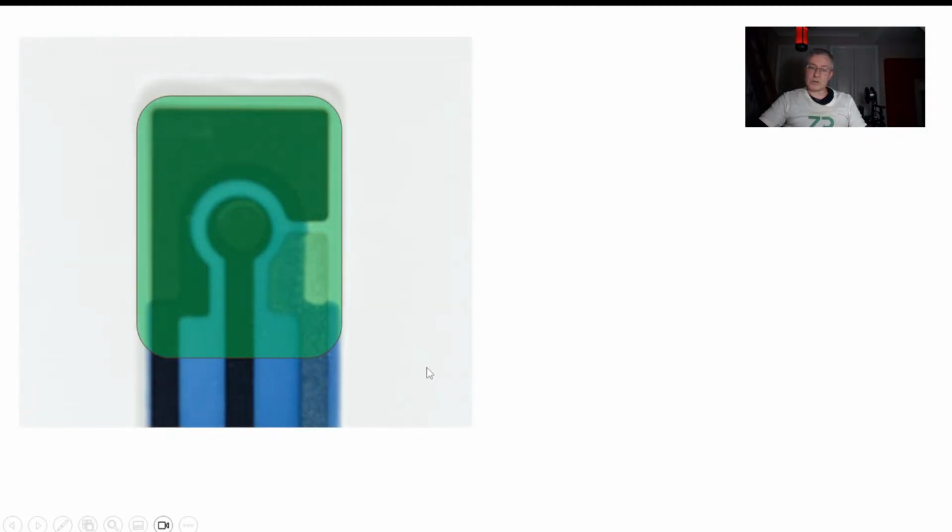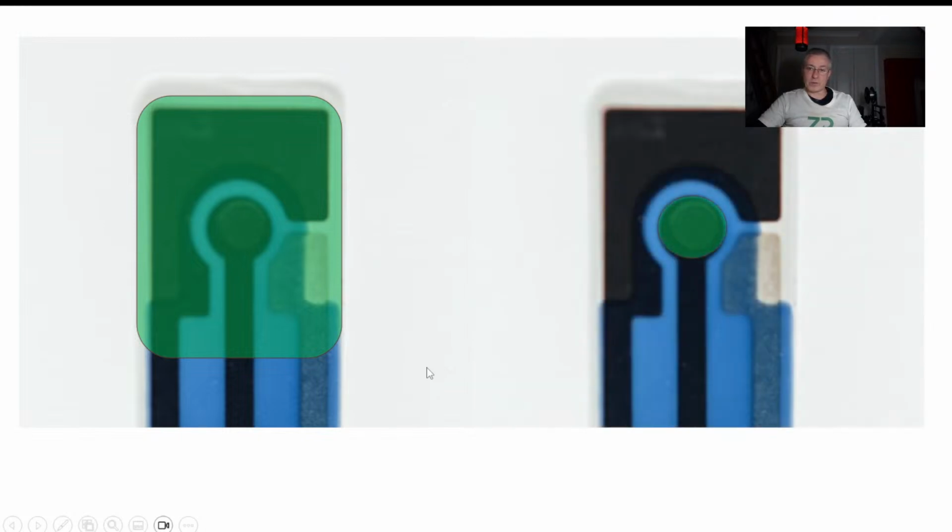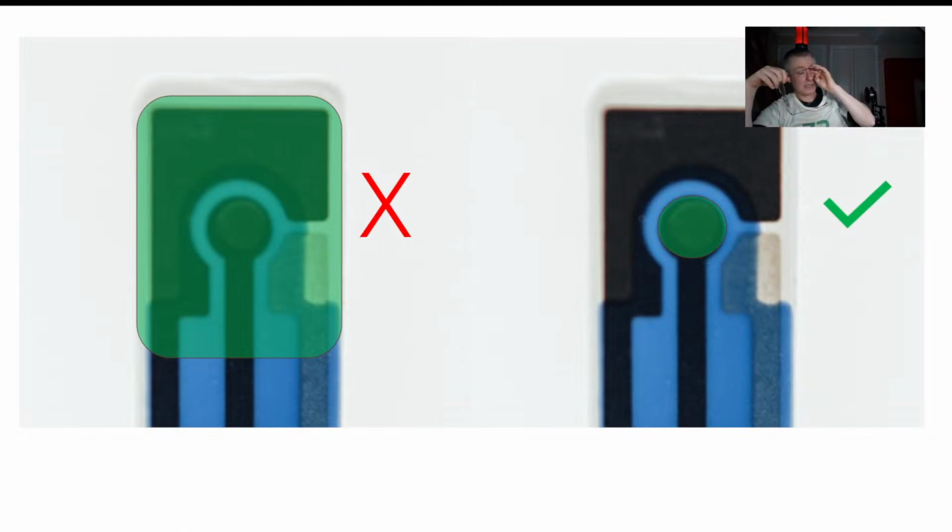When you're functionalizing, don't splash the material like this. Get that functional material on that working electrode. So not this, but please do it this way. Why am I saying that? Because there's no point in putting the enzyme on the counter electrode. It's not where it's meant to be. And it can lead to weird phenomena where you've got a reaction taking place on the counter electrode, but that reaction, if it's in terms of a lactate oxidase, it's producing hydrogen peroxide, which then diffuses over to the working electrode. It's all a bit of a mixed situation. I'd rather have the enzyme where it's meant to be rather than just haphazardly put everywhere. And lactic acid is a good example, actually.